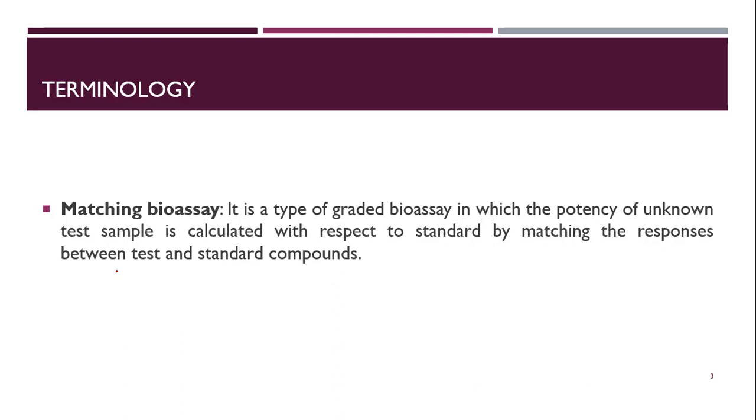Very simple. As the name suggests, we will be matching the response of the test with that of the standard. And because of that, we will get to know the concentration of the test sample in that particular given dose.